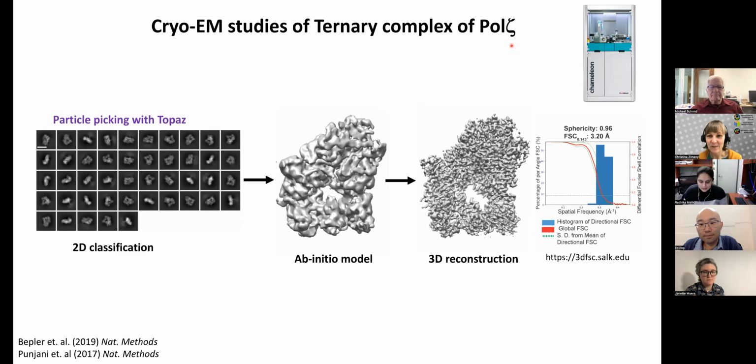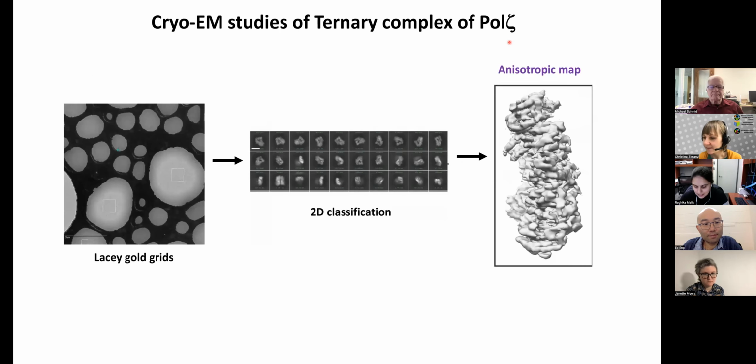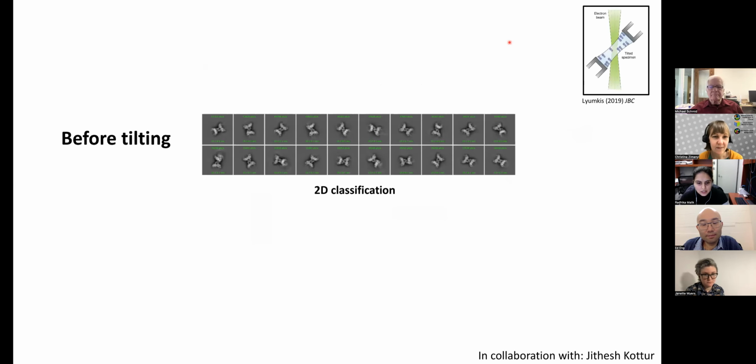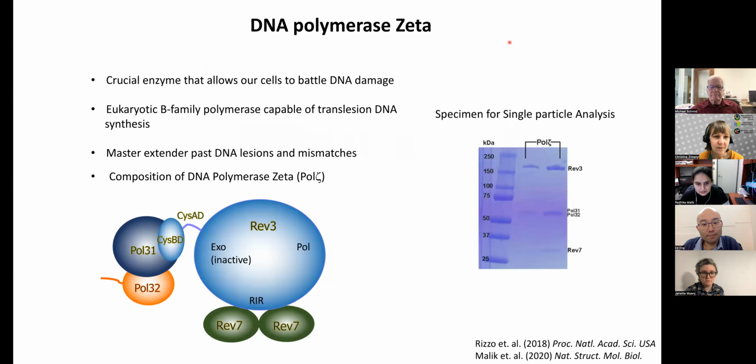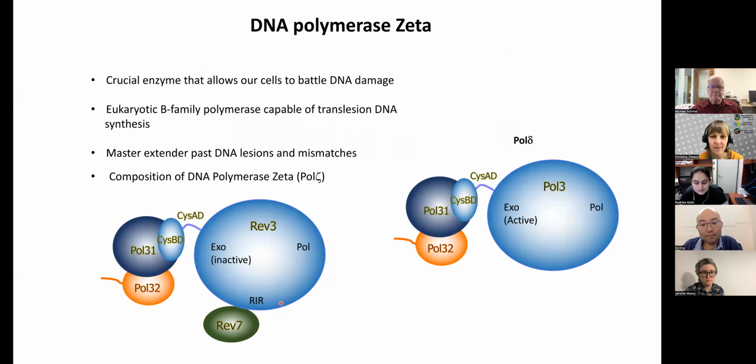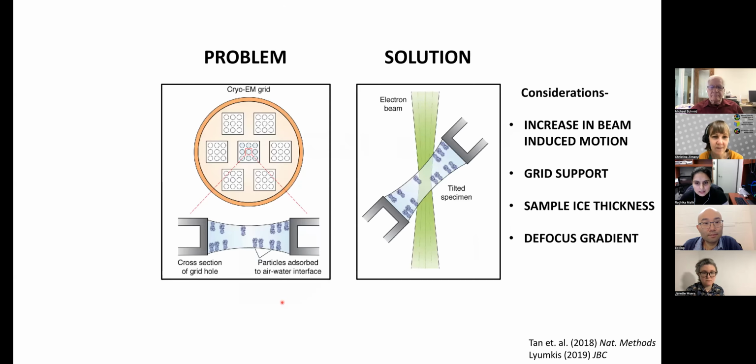So there has actually been an ITC evidence which was published at the same time we actually determined the structure. When we were building the model, we were not sure about the second subunit. So let me go to the map first here.